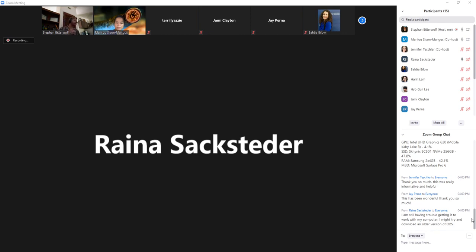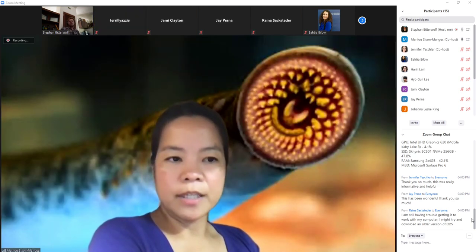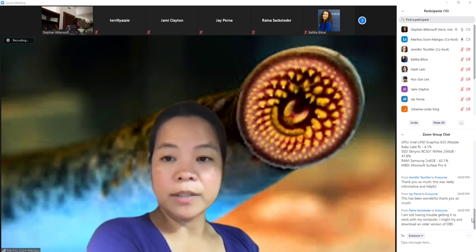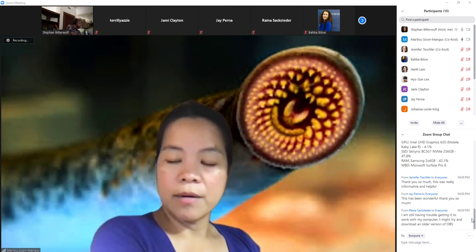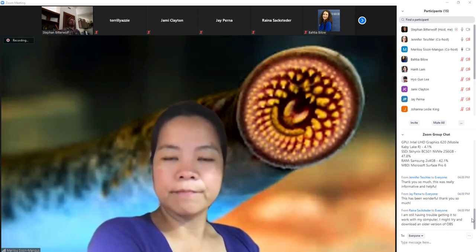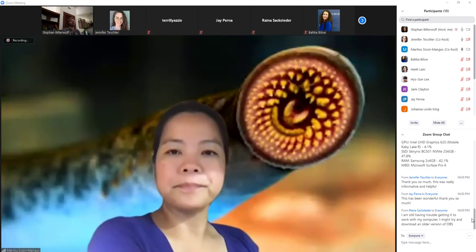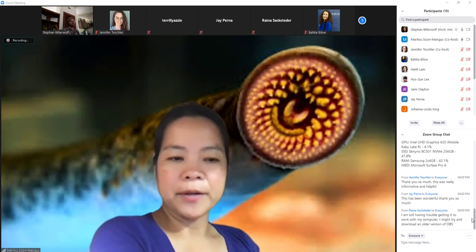For those that are much more advanced with computers, for instance, with more know-how, you can start installing QIIME. They have a very good tutorial. Someone who's not computer savvy, even I found the instructions to be pretty straightforward. Great. That would save us some time later.